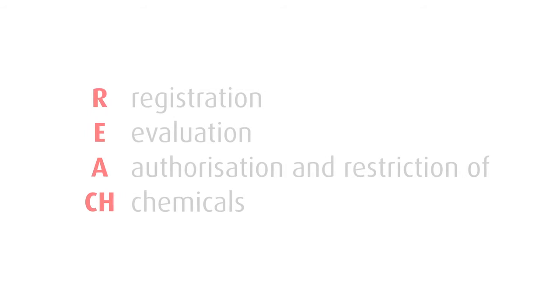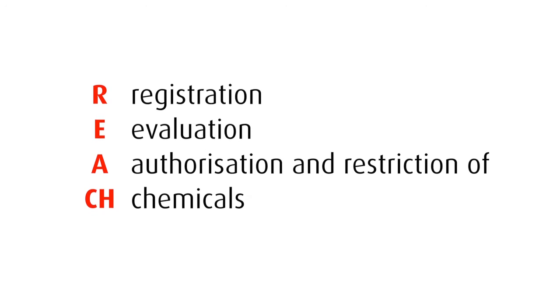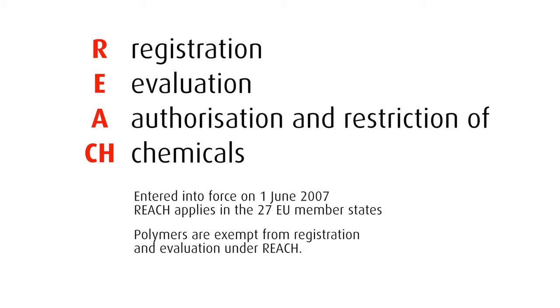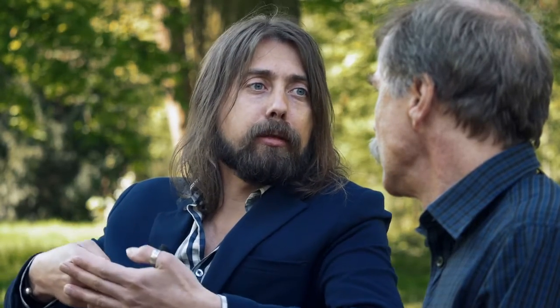So what does REACH have to do with polymers? What's the connection? REACH means that all substances must be registered, but polymers don't need this big part of regulation formalism. Right. Therefore, for some customers, it's very important to show that they have a polymer and not any monomer or substances. Right. So essentially, we need to prove we have a polymer, yes, right?